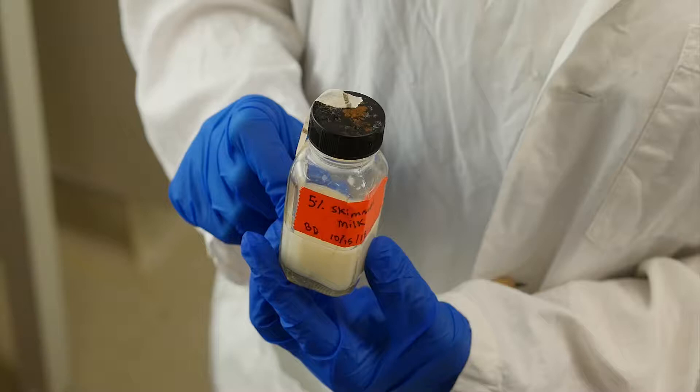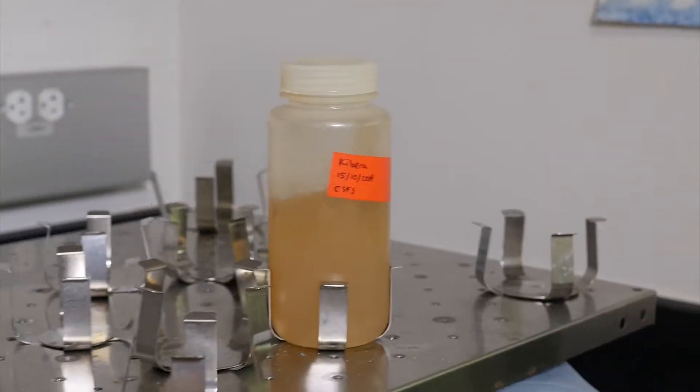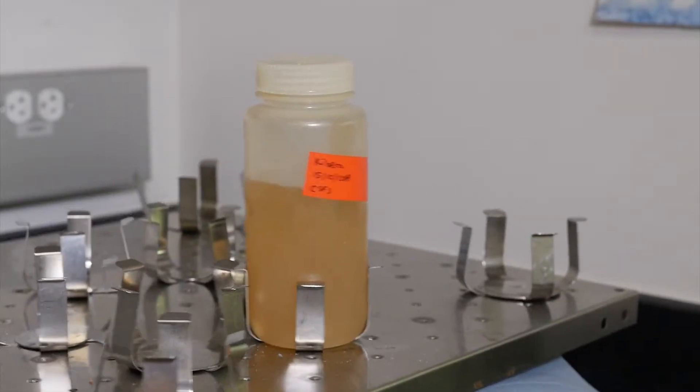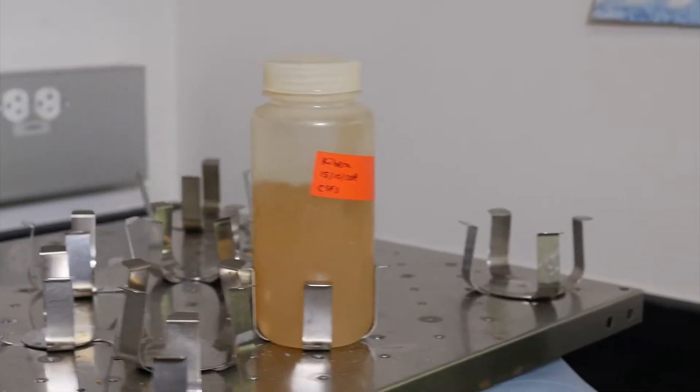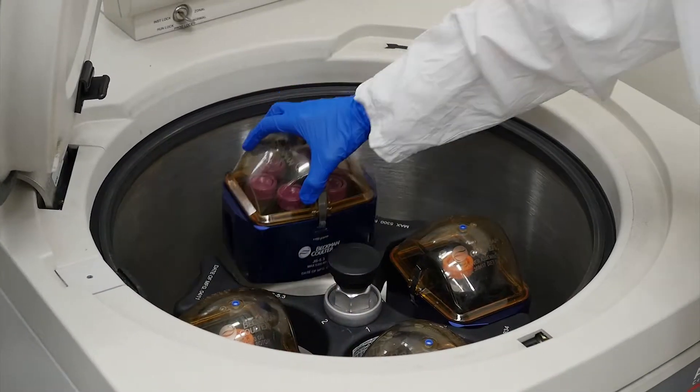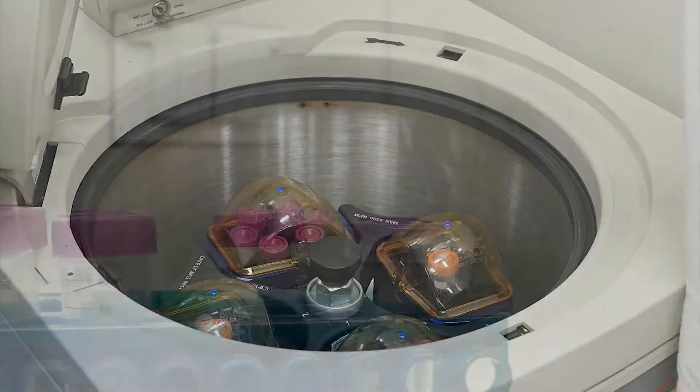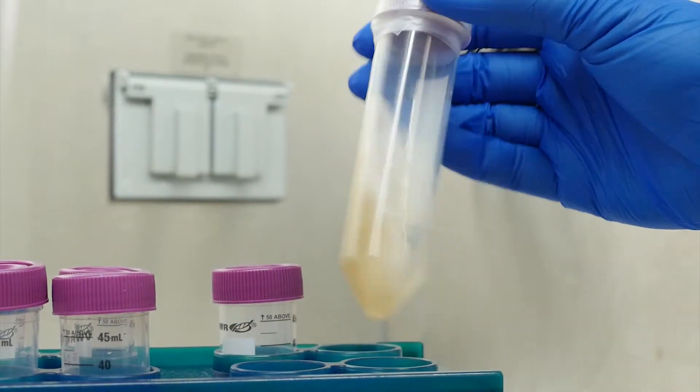The sample is then secondary concentrated by skimmed milk flocculation. After skimmed milk is added to the sample, viruses and bacteria form flocs while shaking. These can then be collected by centrifuging and resuspended in a small volume to increase the method sensitivity.